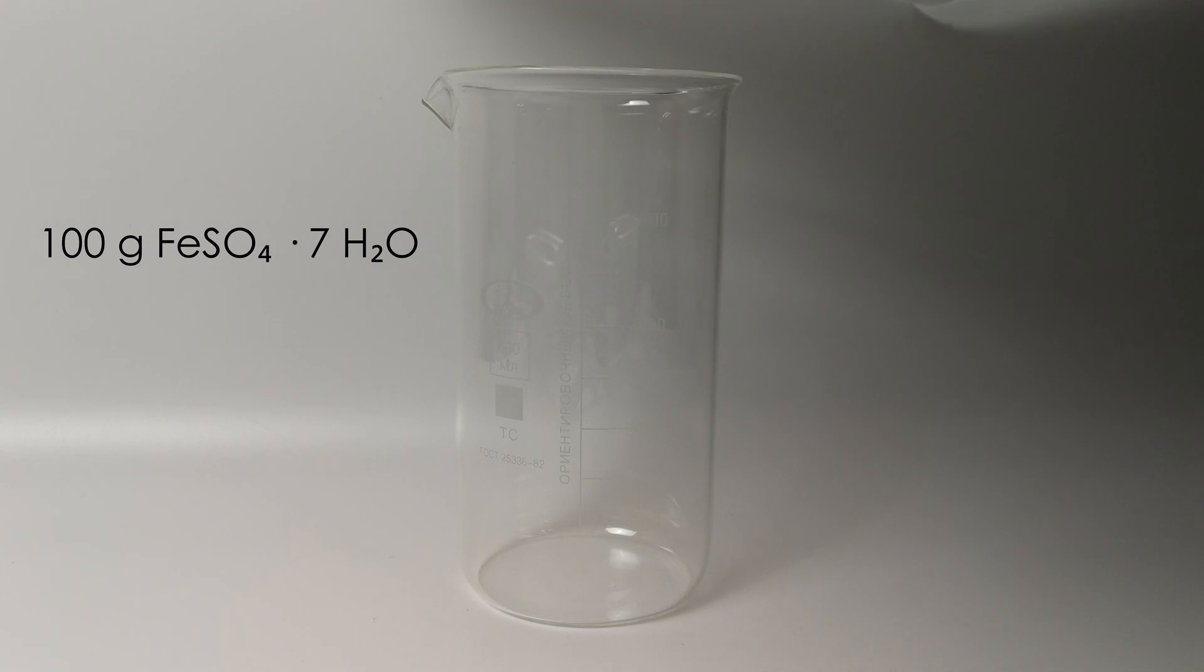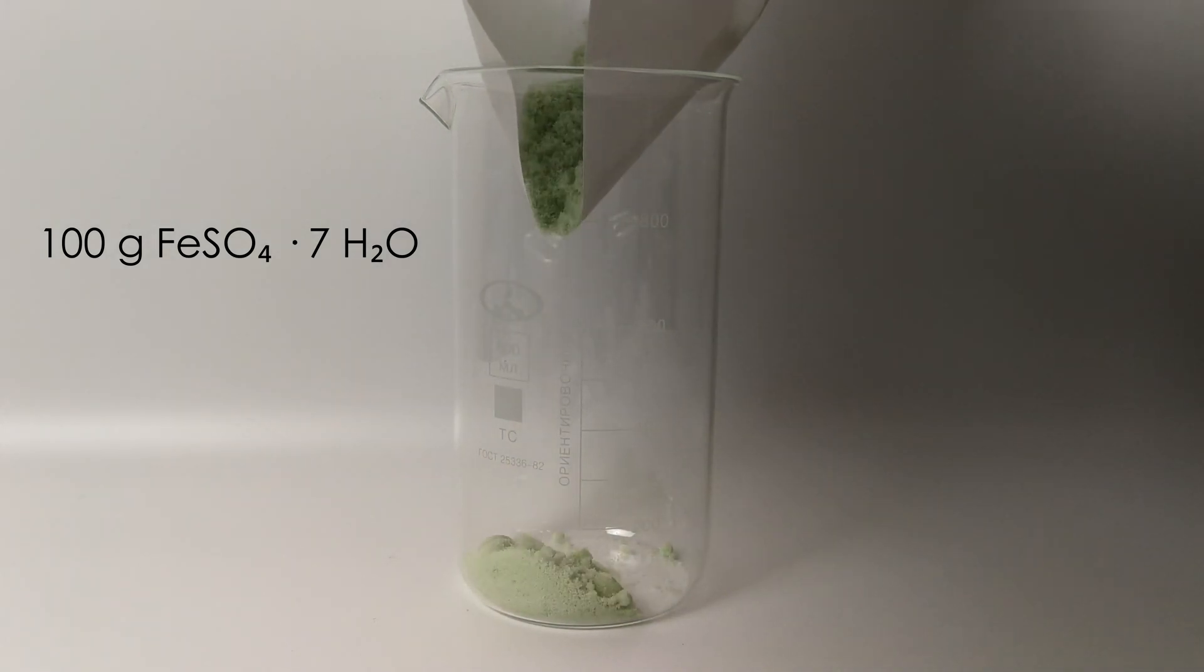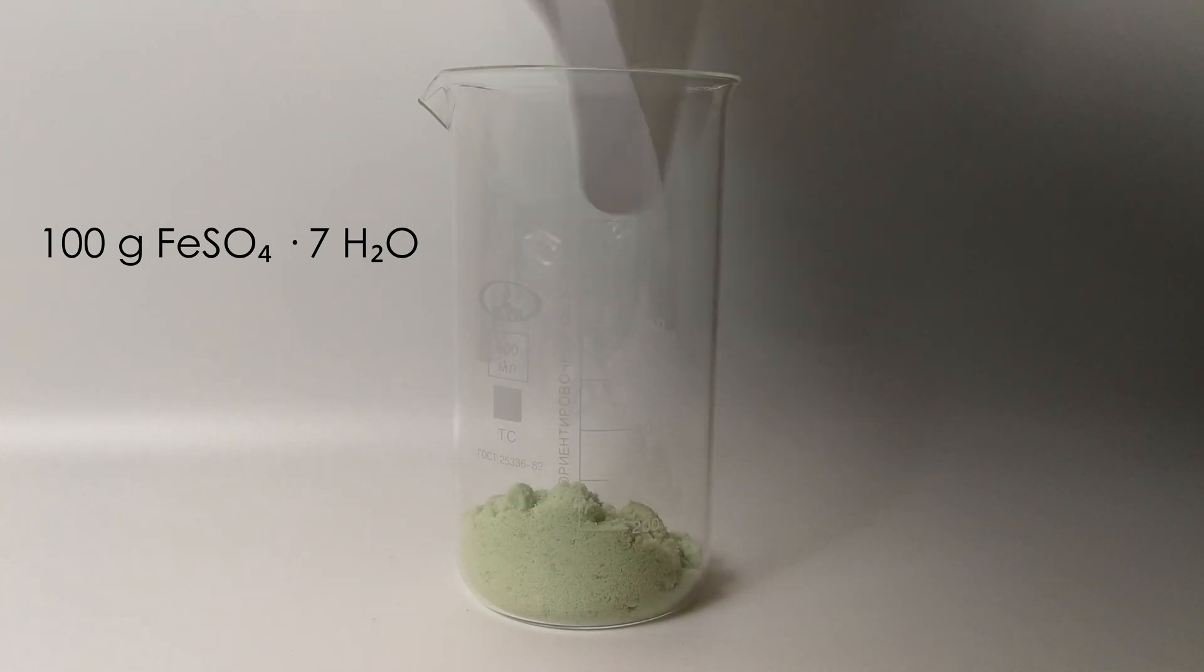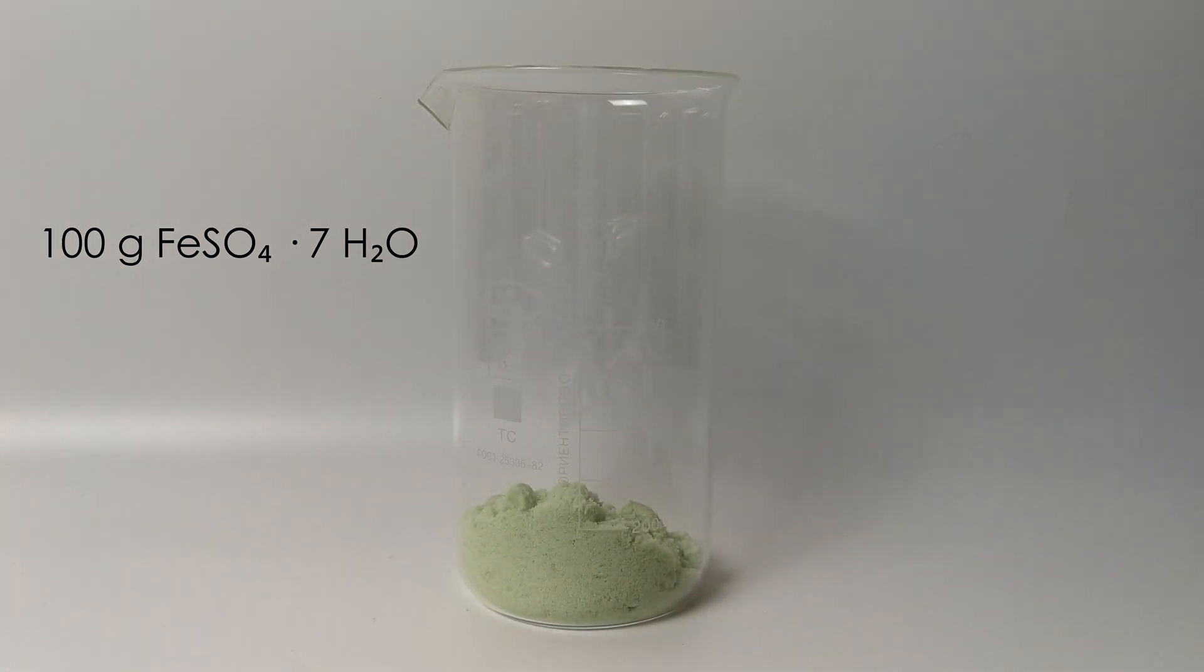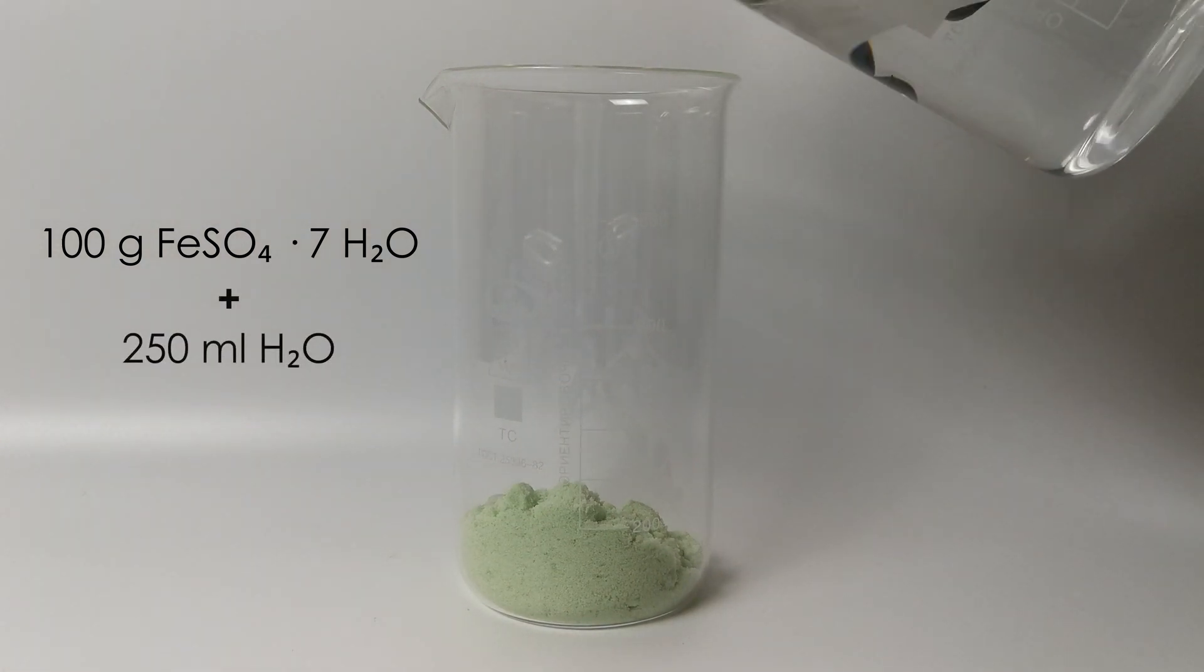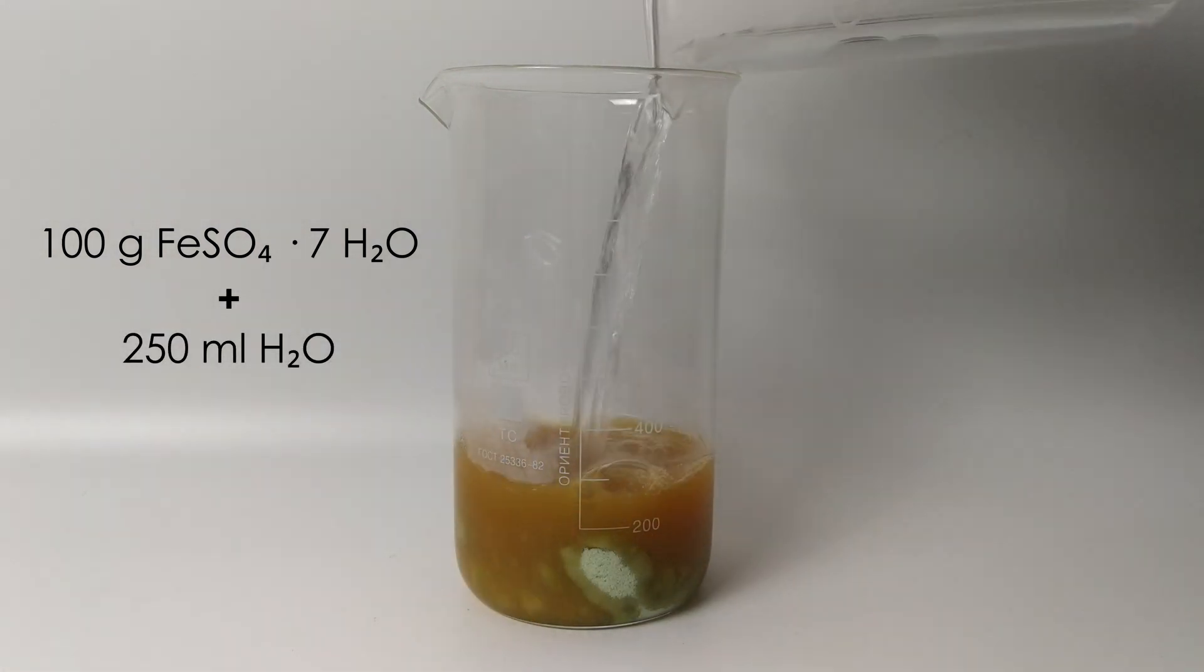To start, we add 100 grams of ferrous sulfate heptahydrate to a beaker. Next, we dissolve everything in 250 milliliters of hot water.